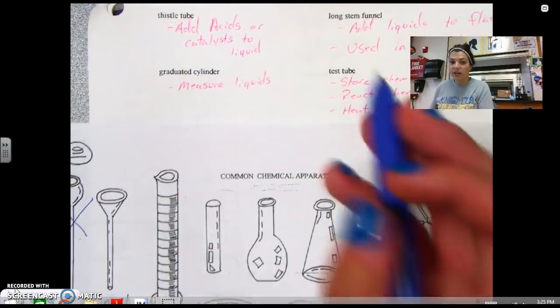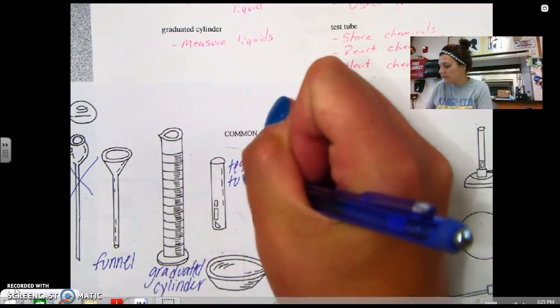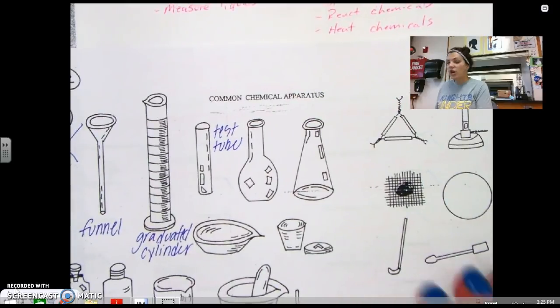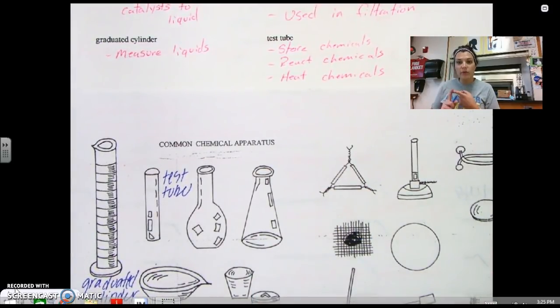The next thing that we have here is our test tube. This is what we're going to use most of the time. And obviously, you can see that we can do multiple things with test tubes. We can store chemicals inside of a test tube, we can react chemicals inside of a test tube, we can use it and hold it over a Bunsen burner and heat chemicals up inside of a test tube. So it does a lot of different things for us.